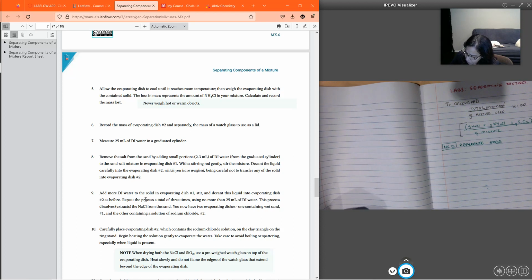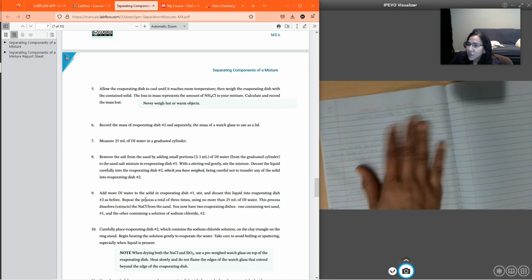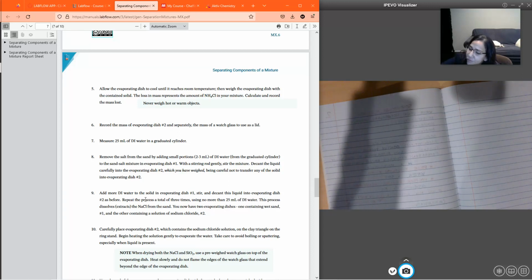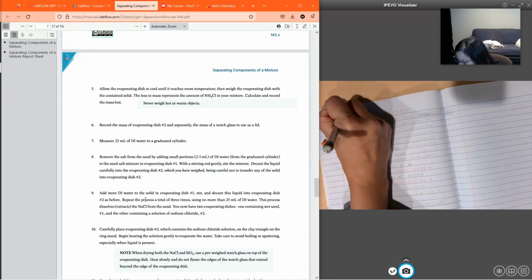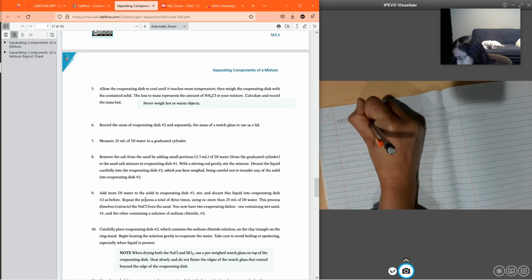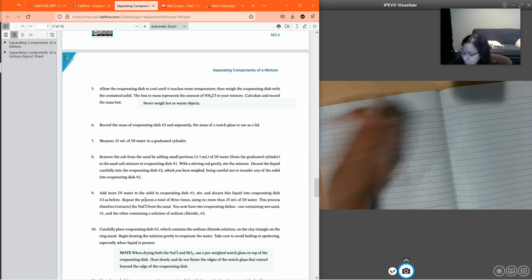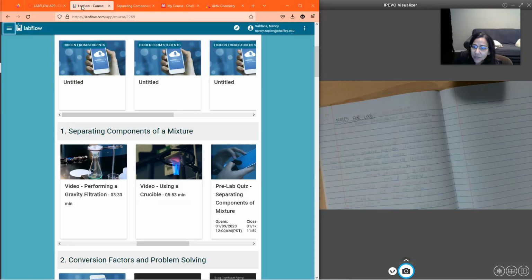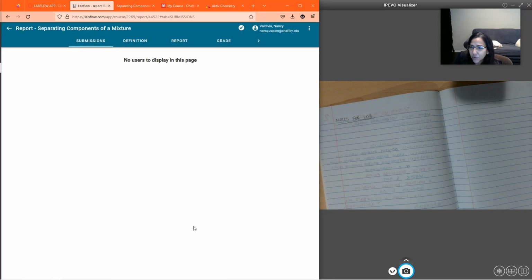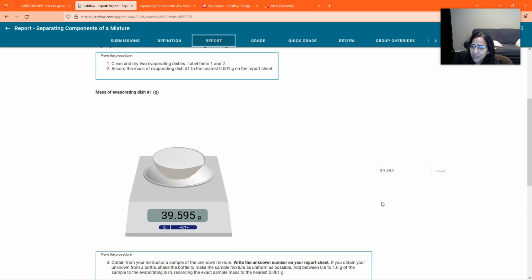So when it's time to start recording your notes, put it on the back of the page, right? So this could be like your notes for your lab. I like to take my notes in pencil because they're scratch notes. So like, how much did you record? Those kinds of things. Like, what did you write down? I'm not going to reset my attempt. I'm going to keep it.